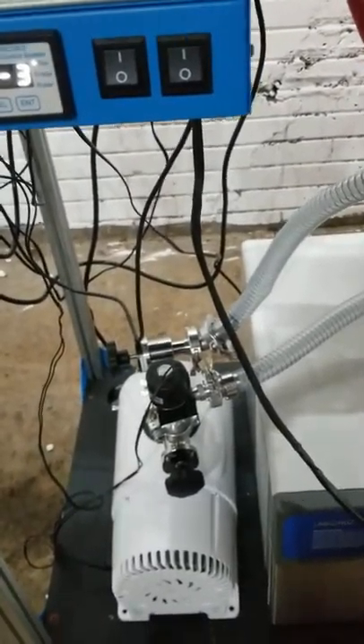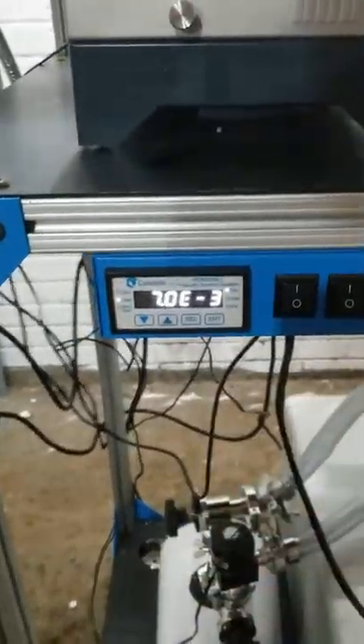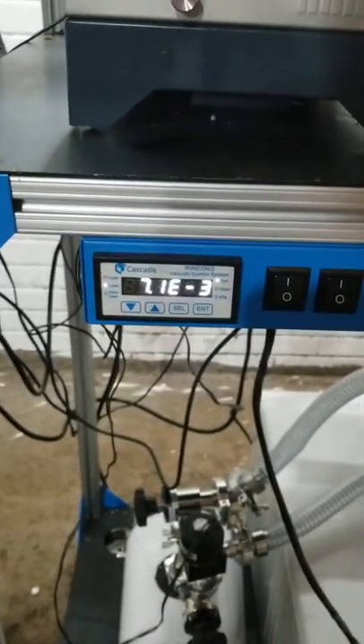If nothing is wrong, you can operate with the diffusion pump and it should get you to really deep vacuums. As you can see right now, we're at about seven microns, which is great.